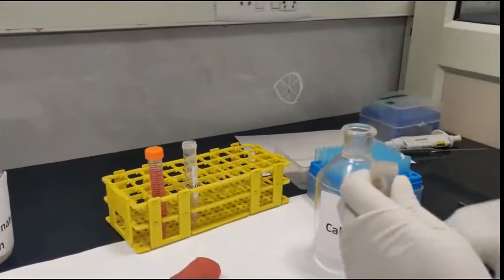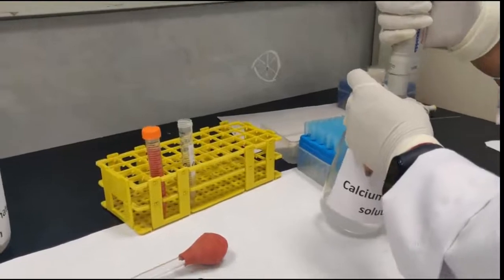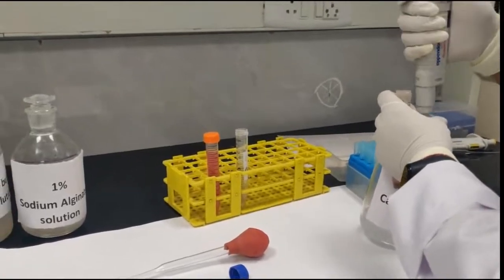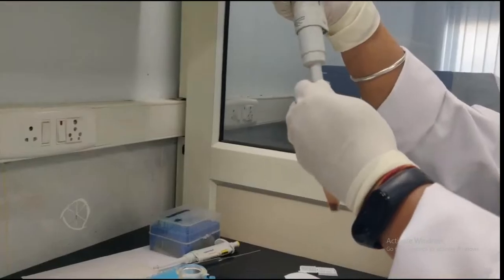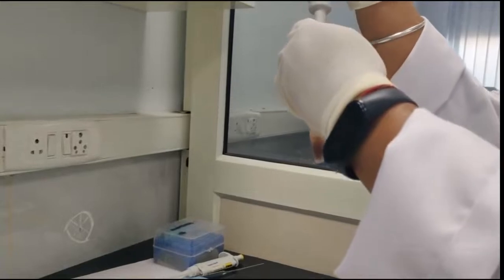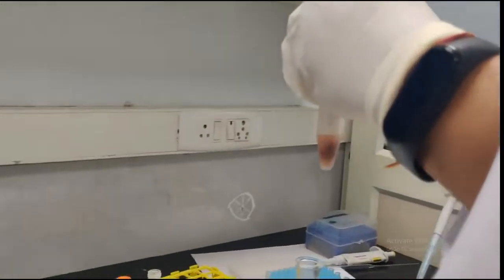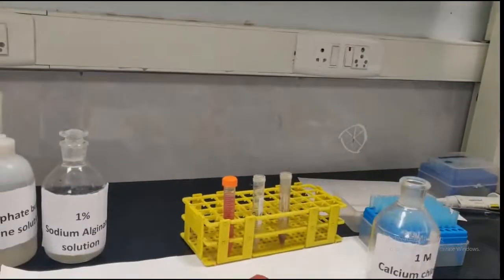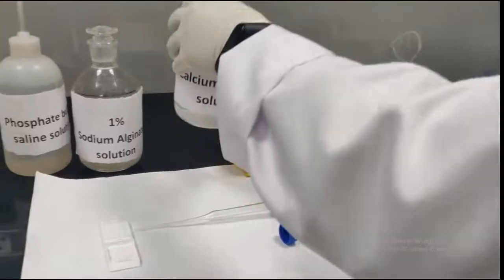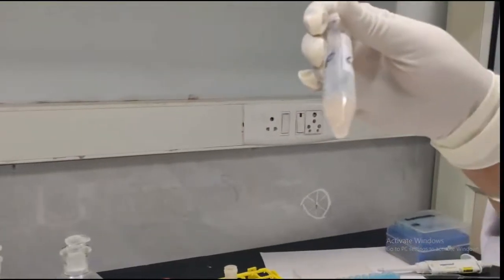So now 0.5 ml, 500 microliters or roughly 10 drops of the 1 molar calcium chloride solution. Make sure you are putting it at the bottom of the falcon tube. So mixing. So now a gel has formed. And now this gel with our cell sediment will be processed as a small tissue biopsy. You can see a gel has formed, so it is not moving now.